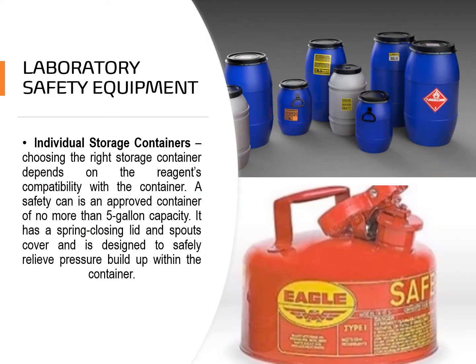Now we go to laboratory safety equipment. These are the materials we see in the laboratory that, although they look normal or ordinary, are so useful in times of need, or simply they protect us from hazards inside the laboratory.